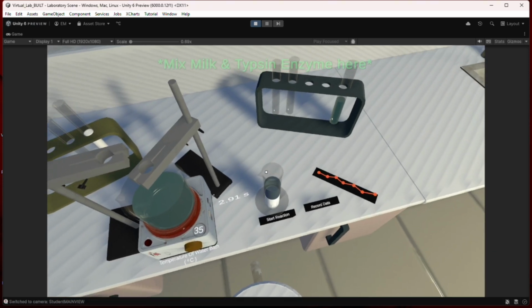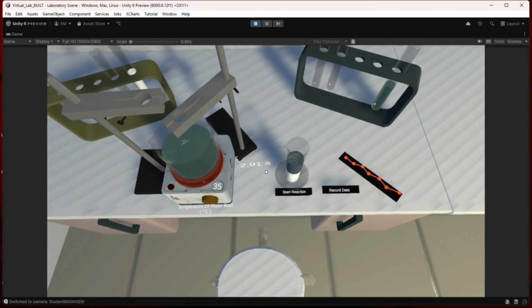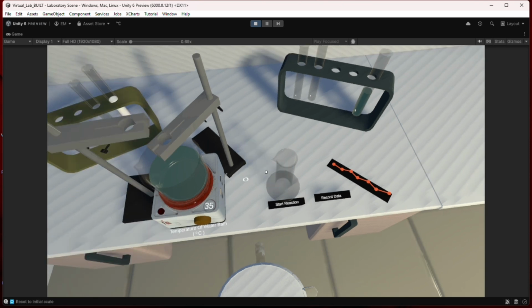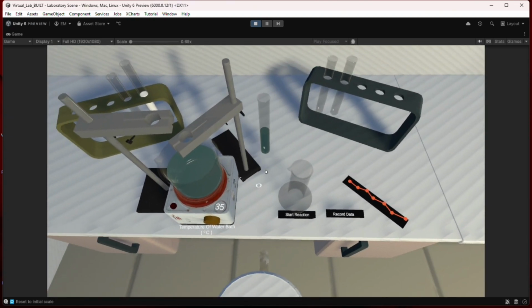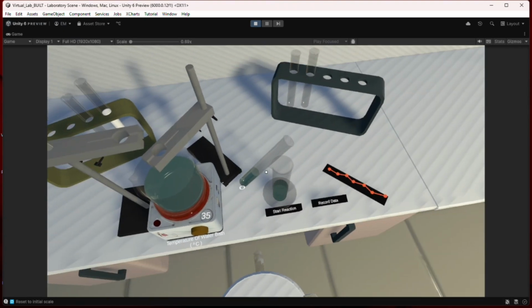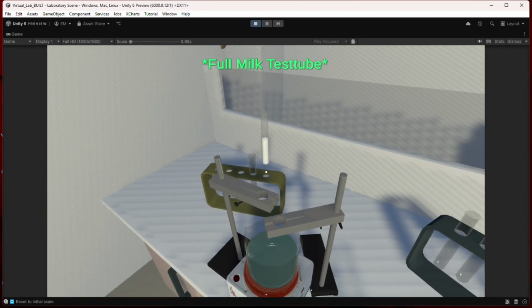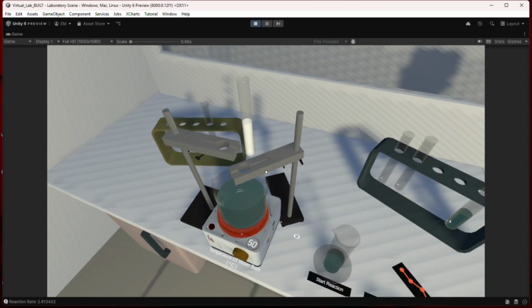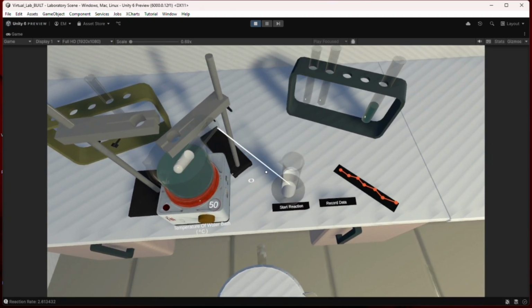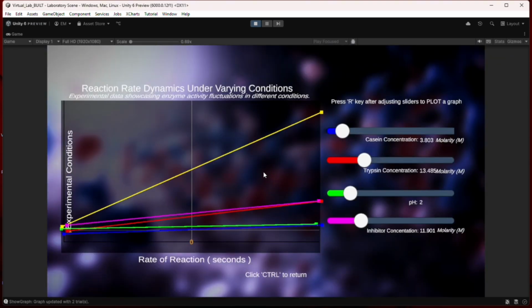Once the reaction is completed, the video exits itself, and I made two views, the 3D view and the 2D view, where you can see the apparatus on one side for better seeing of milk color changes and the rate of reaction. I set triggers to make the test tube understand where to pour. You can see the graph is drawn in real time.